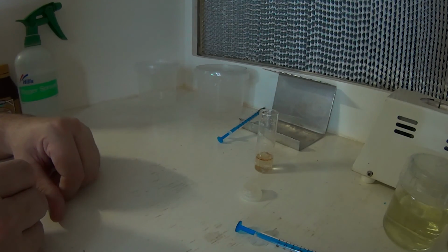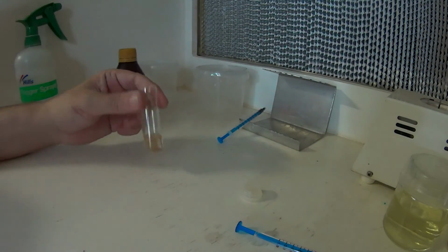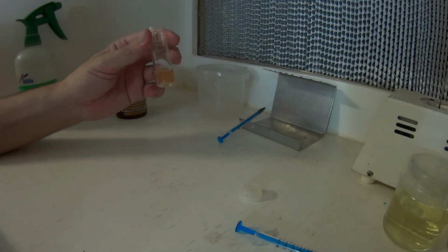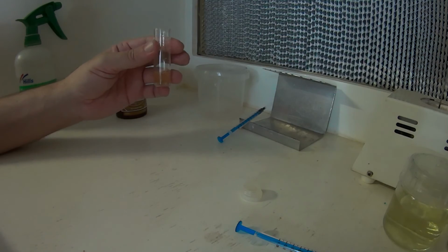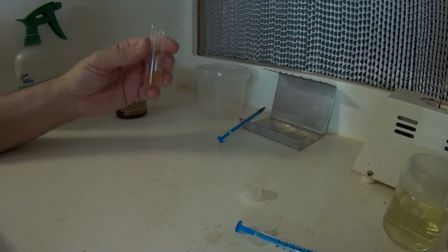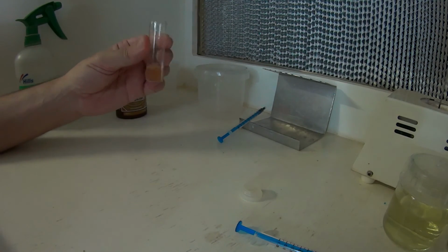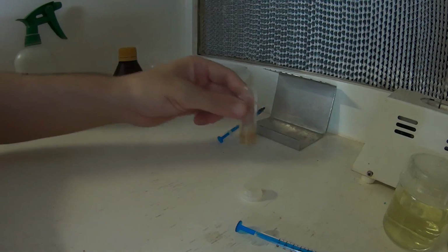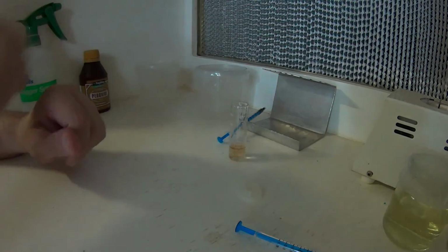So it's pretty straightforward. And like I said, because we use the hydrogen peroxide, 3% hydrogen peroxide, there's no need to rinse this. Like if we had to use bleach to sterilise this, we'd have to rinse it in distilled water a couple of times and then inject the distilled water in there instead of the hydrogen peroxide. But this works quite well. So this is the process I used. And hopefully we'll have some orchid seed and not fungus or mould.